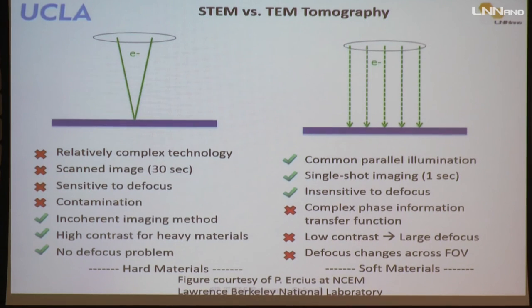And there is a lot of contamination problem. This beam usually induces carbon contamination very easily. It's usually a big problem in a lot of STEM tomography cases.